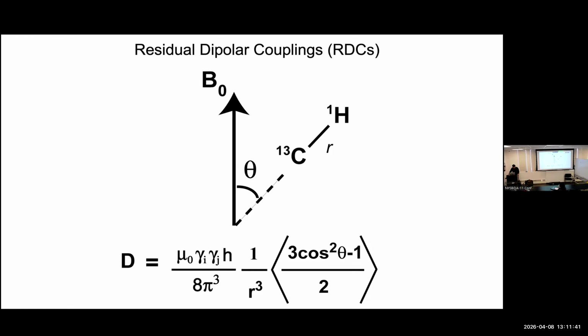So I'm going to be introducing RDCs quite a bit today, but I will fuse it with nucleic acids to show applications of RDCs to nucleic acids. Tomorrow's lecture will focus on more of your generic question, how do you assign a nucleic acid, and how does one perform resonance assignment, but also some adaptation experiments. So there's a combination of applications and also some material that involves actual methods.